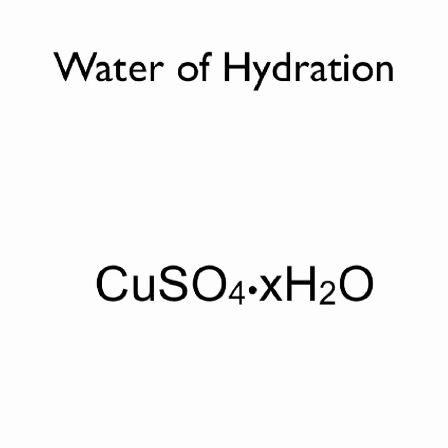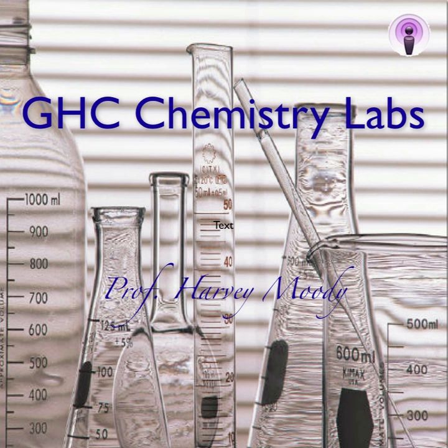And our final formula for the copper-2 sulfate ought to be CuSO4·xH2O, where we have determined the number x in today's lab. So in today's lab, we've used a rather simple experimental procedure to remove waters of hydration from the compound, and then from the masses of water driven off and the mass of the sample, we were able to determine the number of waters of hydration, essentially an empirical formula for this compound.